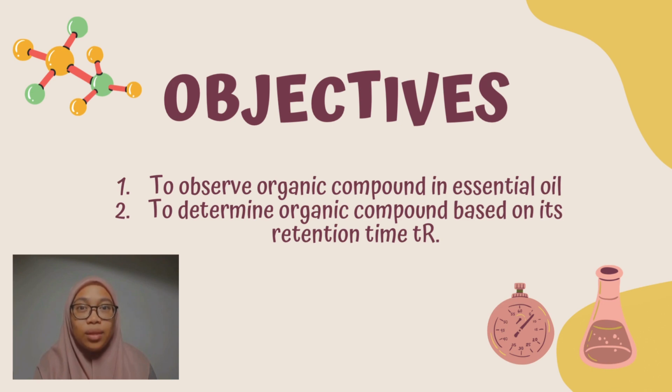The case study begins with the objective. Firstly, the objective of this case study is to observe the organic compound in this essential oil, and also to determine the organic compound based on its retention time.